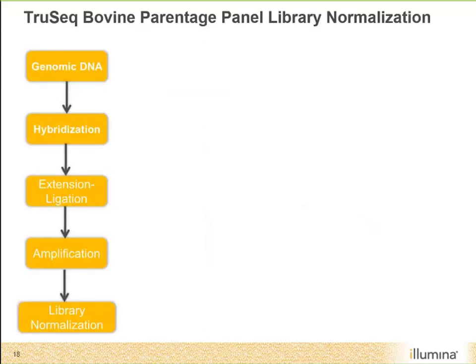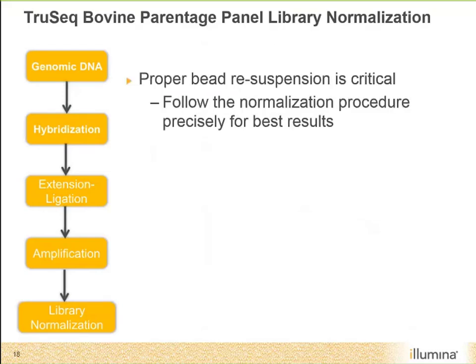So, a little bit more on the bead-based library normalization. A couple of things to keep in mind: we want to make sure that the beads are completely resuspended, and it's very critical. These beads tend to be a little bit more sticky, so always make sure that we have properly vortexed them until all of the beads are in solution, and that we follow the normalization procedures within the user guide for best results.